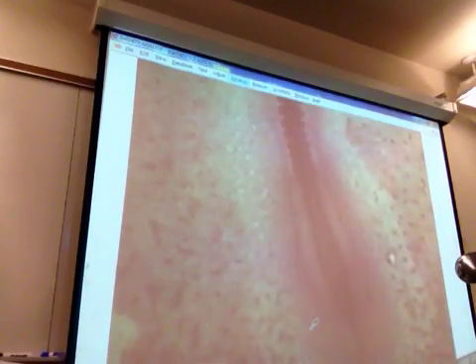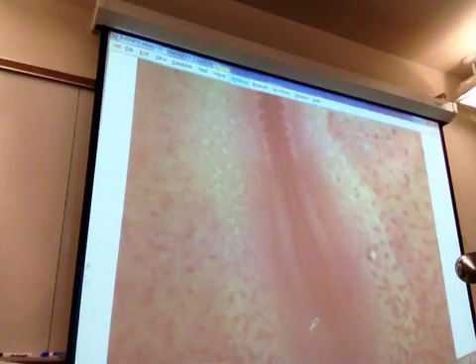And then down here you can see it. Notice the neural tube is not closed at the bottom yet. The head closes before the tail closes. So if you get weirdness in head folding, you can have brain problems, right? Because those brain ventricles don't form the right way because the brain lobes don't form the right way.